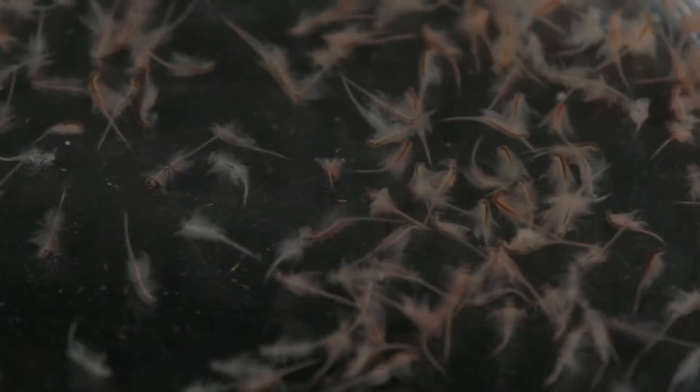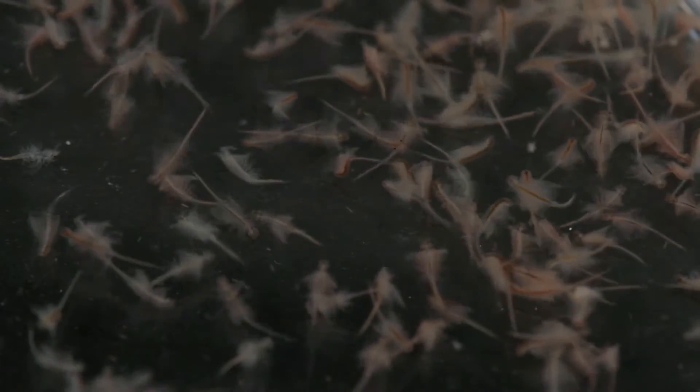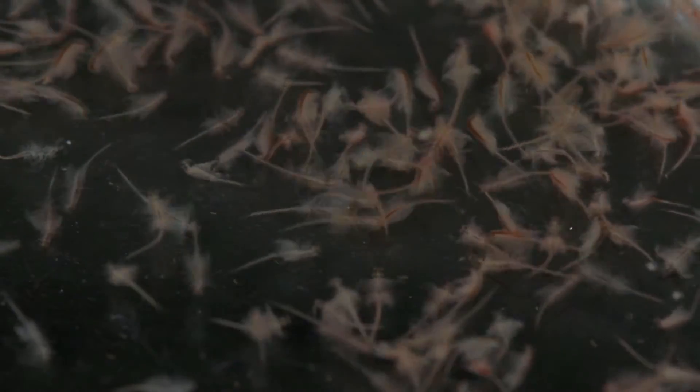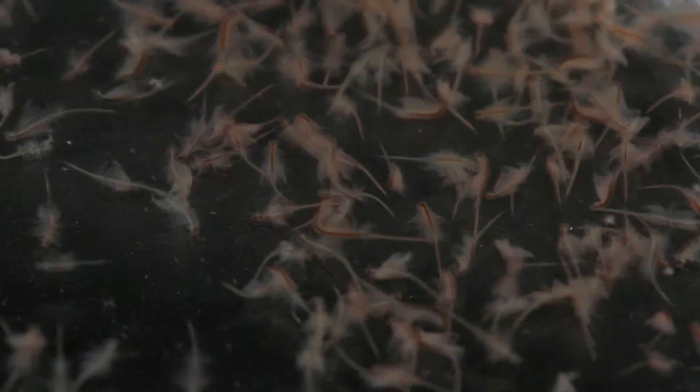Looking for a quick and effective lab to bring the concept of evolution into your AP Biology classroom? It has never been simpler than using the Carolina Investigation Natural Selection Activity.